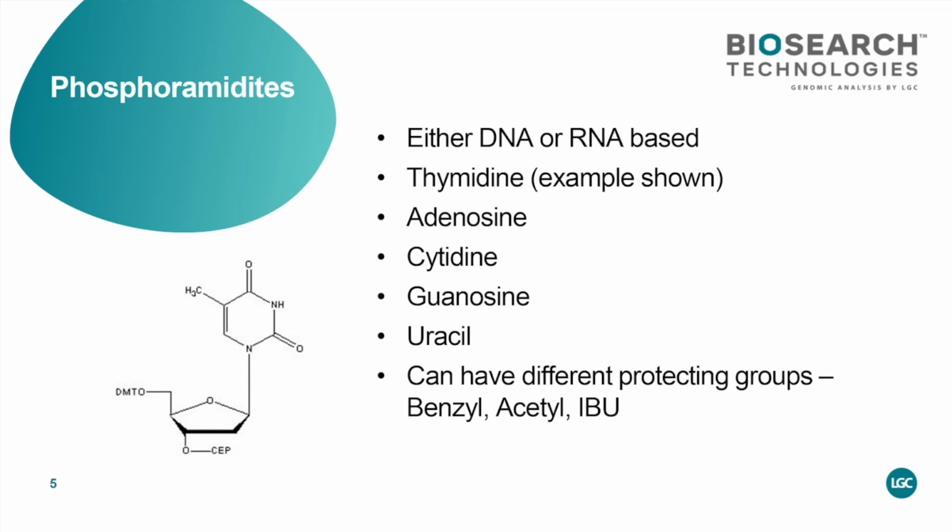For the RNA-based, you will have a molecule attached to the 2' right here. So it will be either OH, which is a basic RNA. You can do 2' methyl, fluoro. There are different modifiers as well, like locked nucleic acid or unlocked nucleic acids. So the basic 5 amidites are thymidine, adenosine, cytidine, guanosine, and uracil. Uracil is the RNA, thymidine is a DNA.